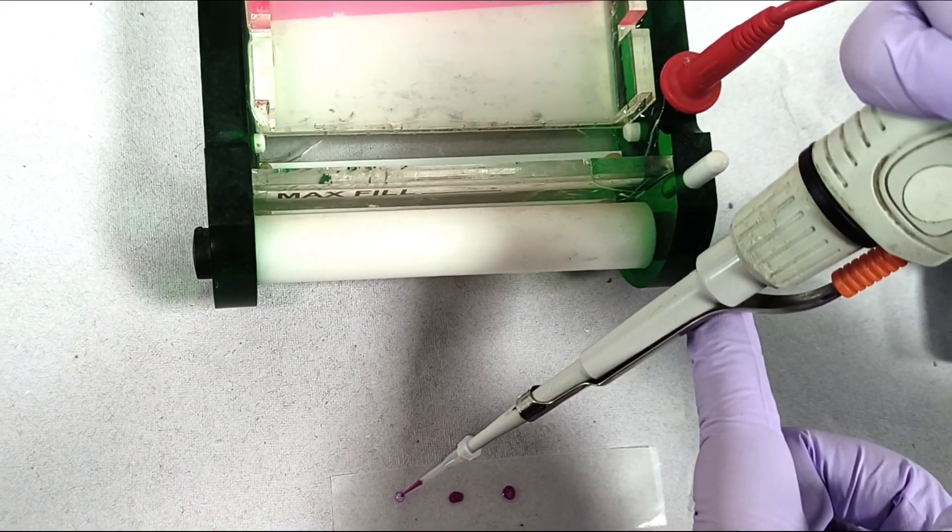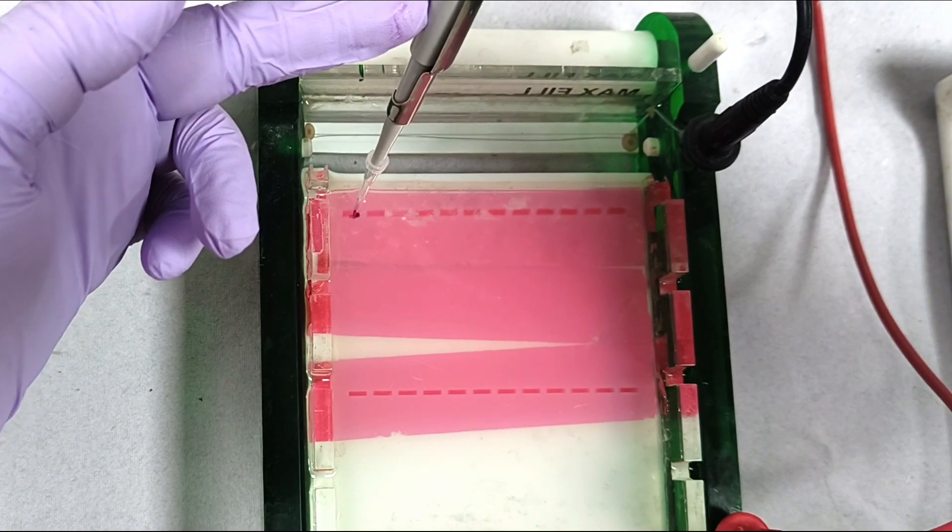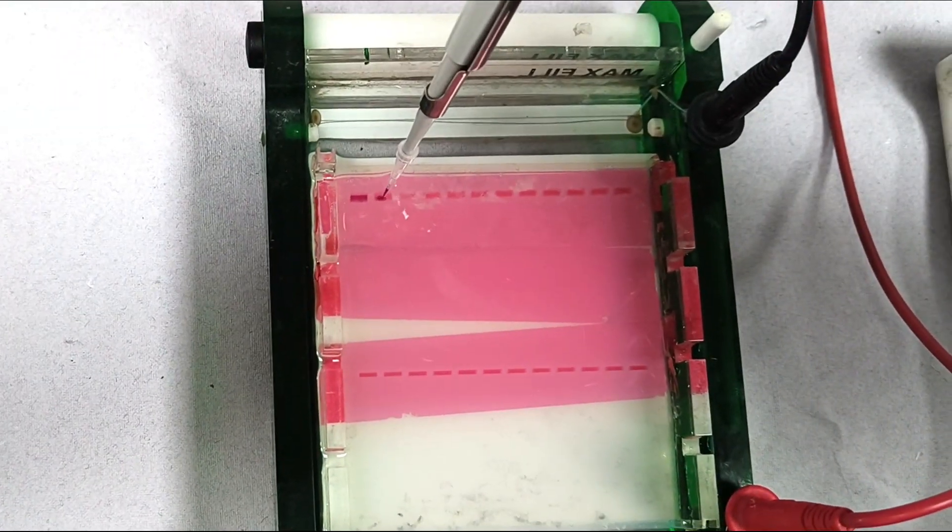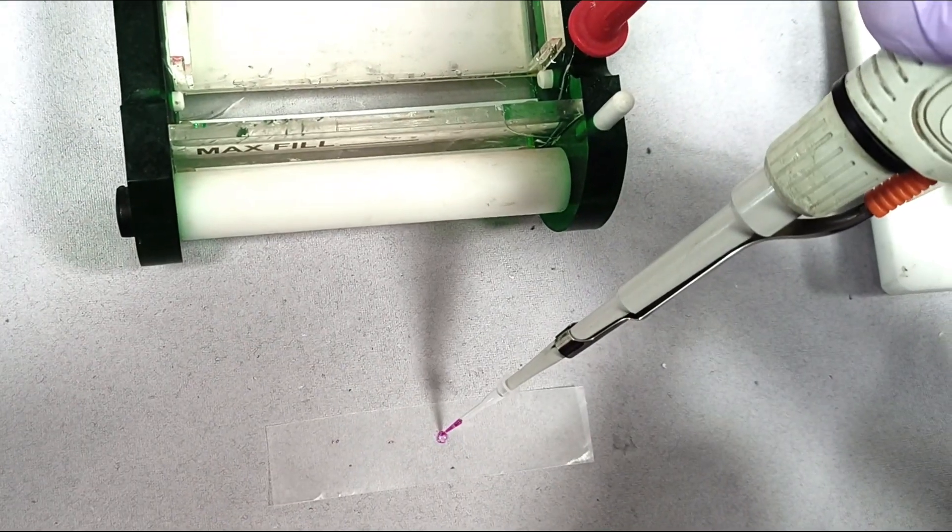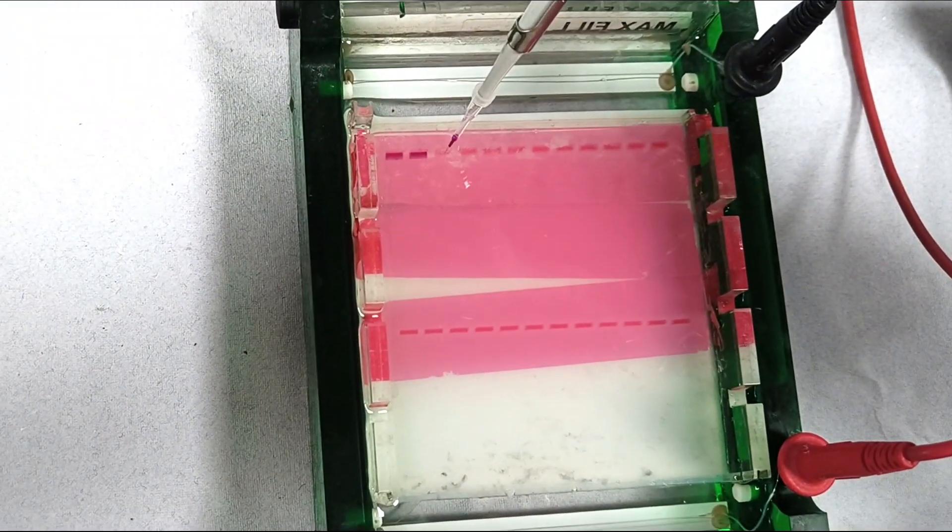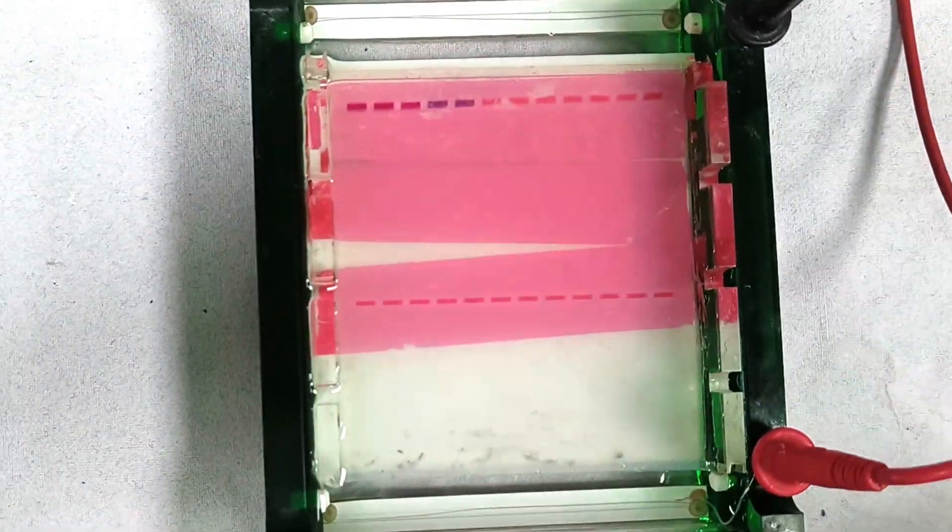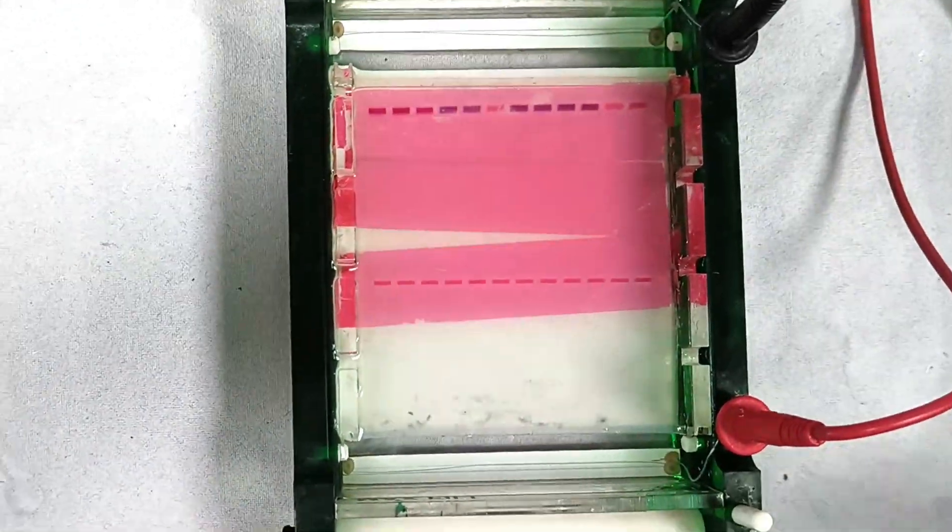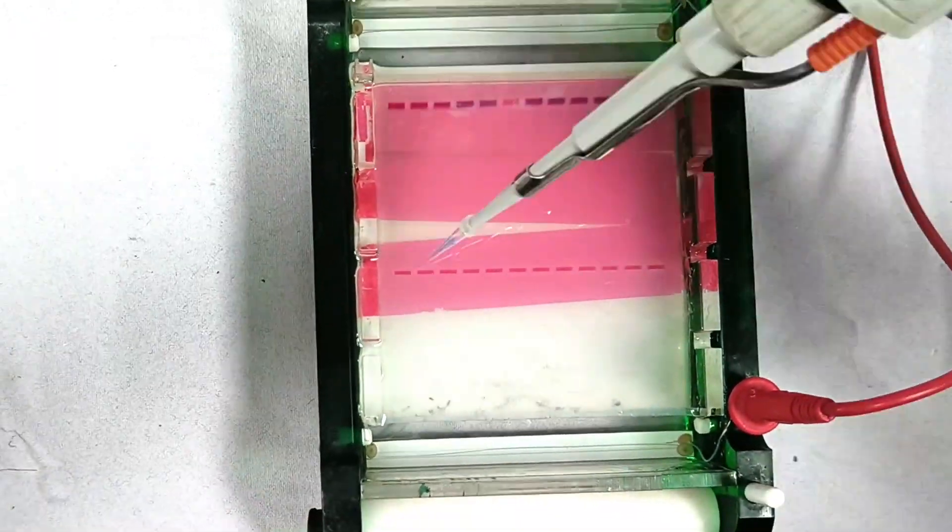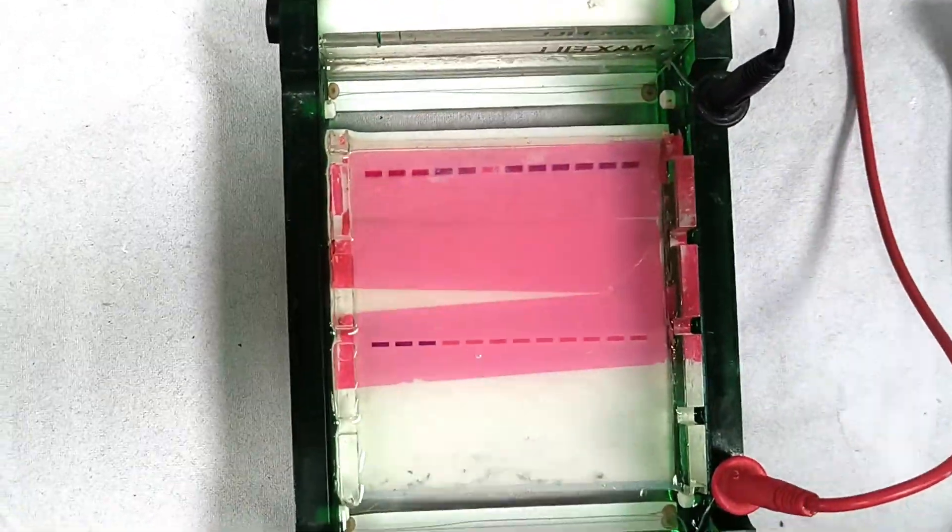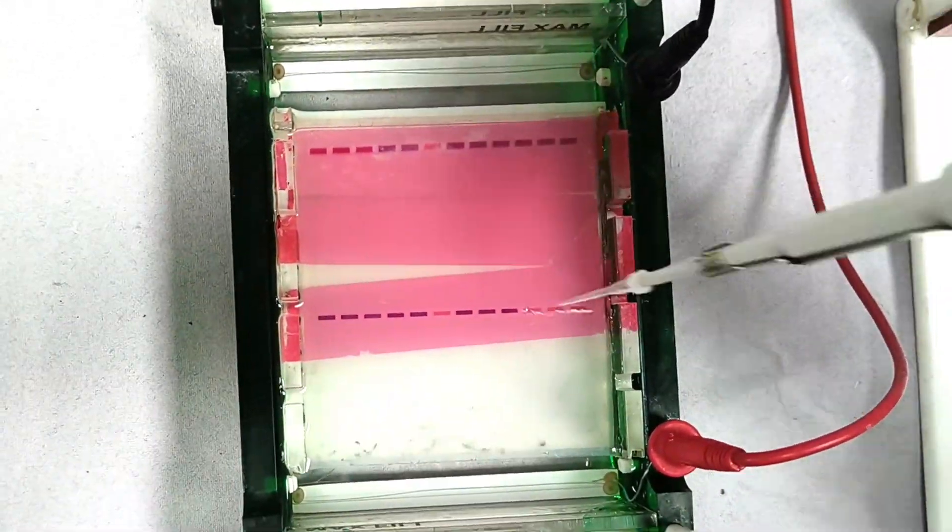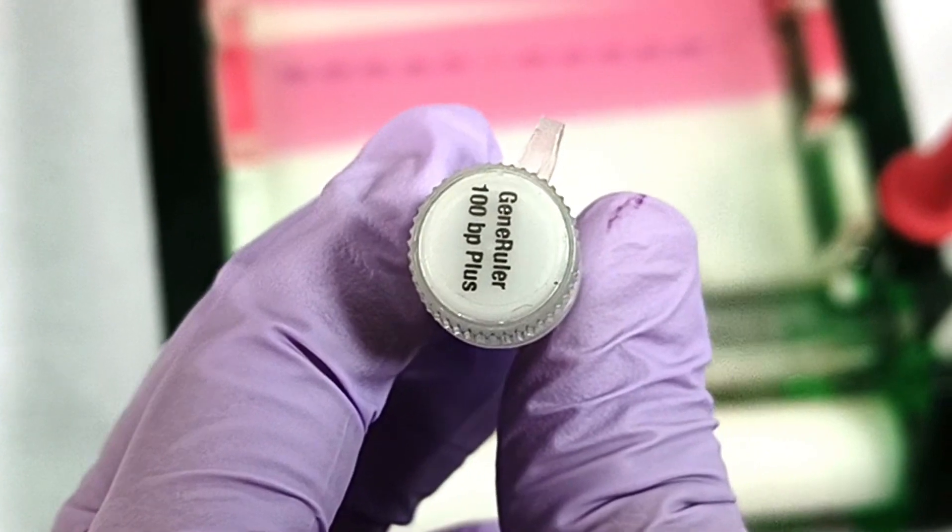Carefully load the samples into the wells using a pipette. After loading all the samples, finally load the DNA ladder. Here we are using a 100 base pair ladder.